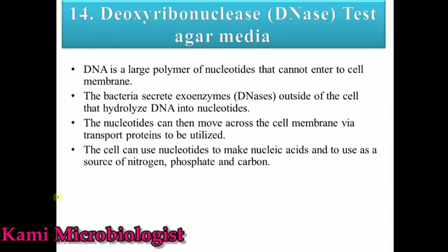Today in this video lecture we are going to talk about another test, the deoxyribonuclease test. For that test we mostly use a media which we call deoxyribonuclease agar media, which contains DNA molecules. Okay. Now let's talk about this test with its introduction.